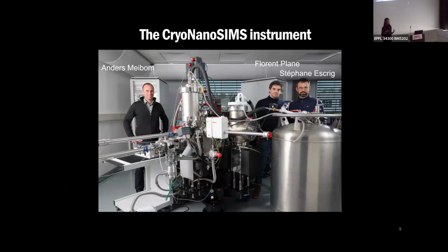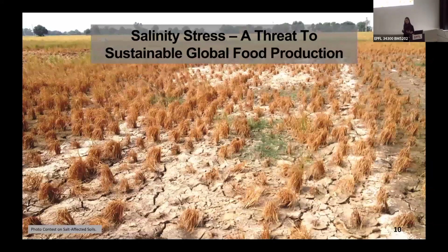And so this instrument can now hold a sample which is vitrified and preserved under cryo temperatures. And then now you can really start answering some of these questions in biology, which were hard to answer before. And you can see the strength this has for biology. And I will talk more about this in the coming slides. And so here comes my plant biologist geek in me, where we were in for a long time. There is this question of salinity stress, which I wanted to introduce to you.